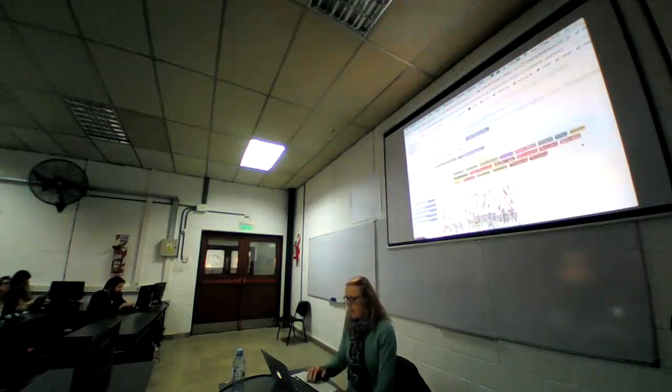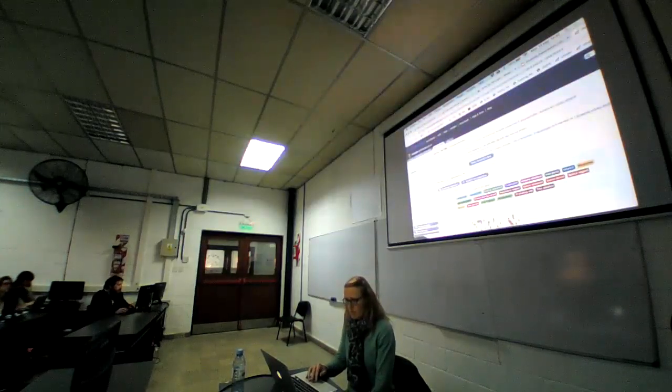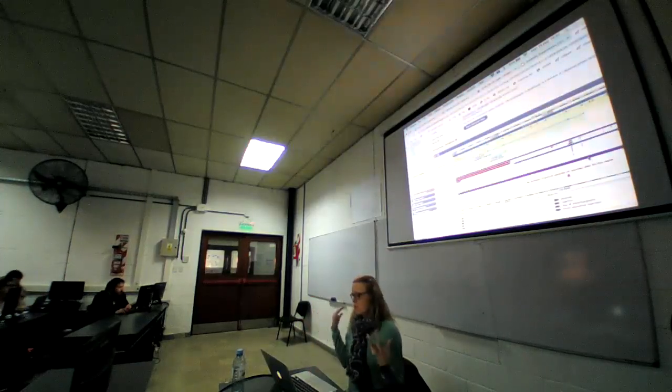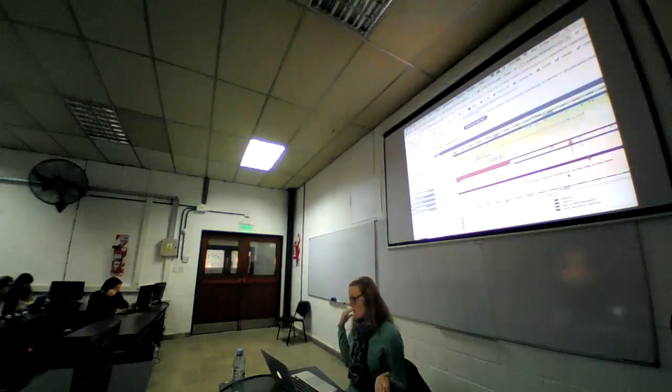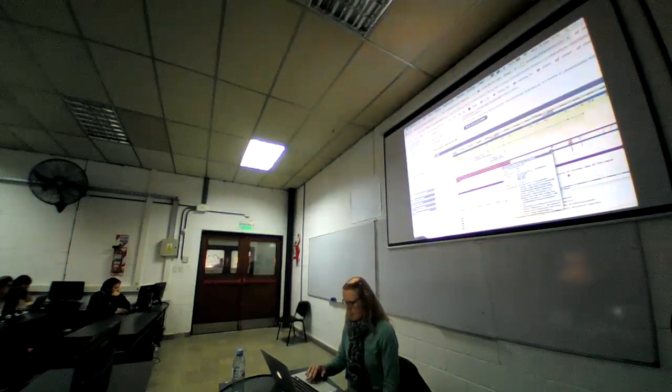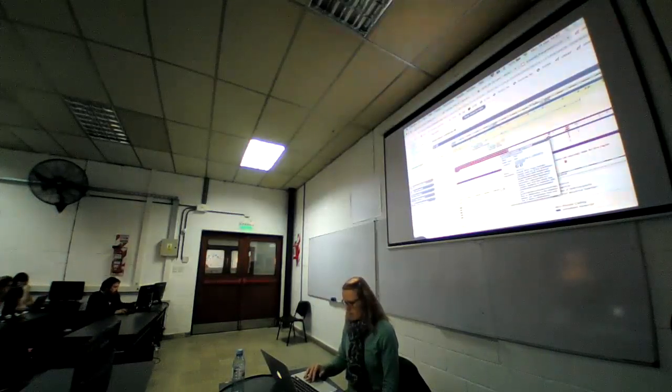For the structural variants, we have the structural variant view under genetic variation in the menu. We differentiate two types of structural variants. The smaller ones, shown here, represent one variant described in one study. So if you bring up a pop-up window here, you can see this variant has an ID and it was described in this study here.